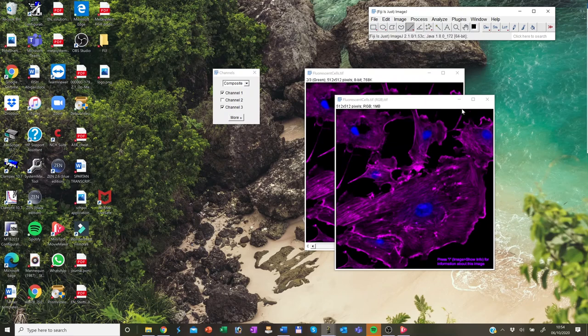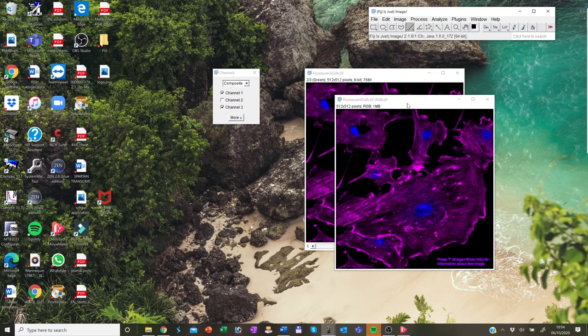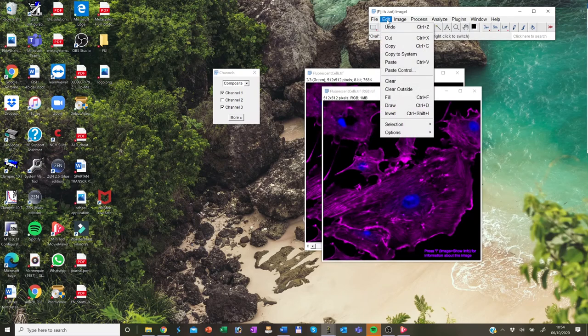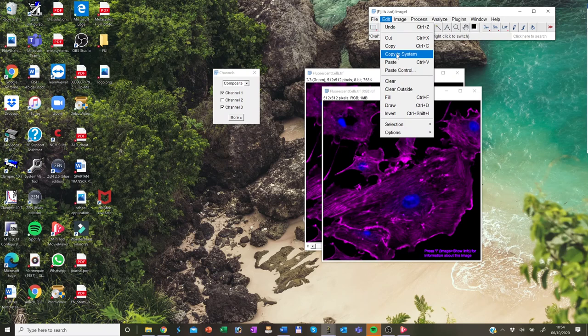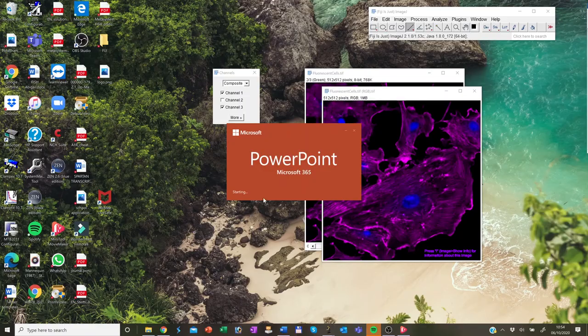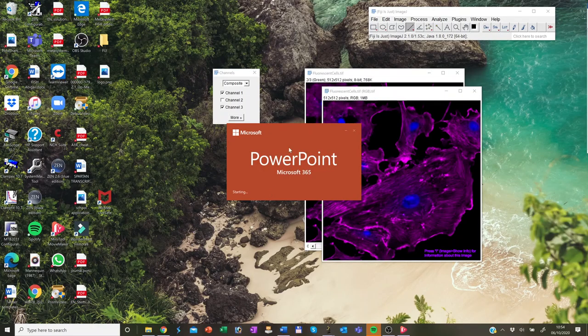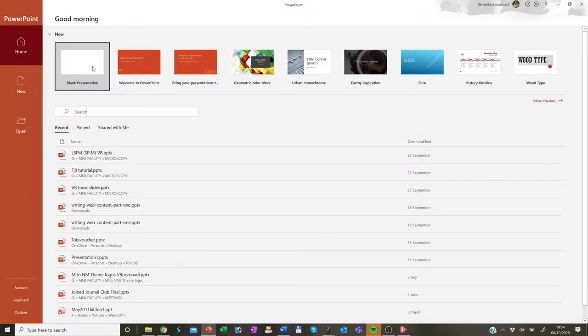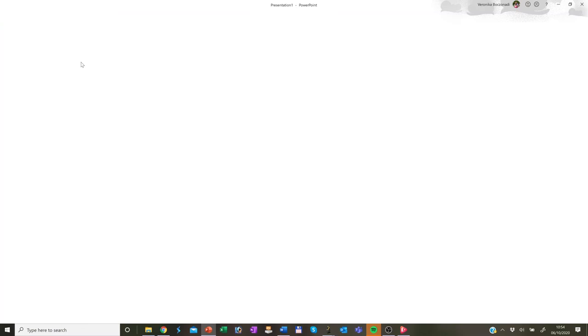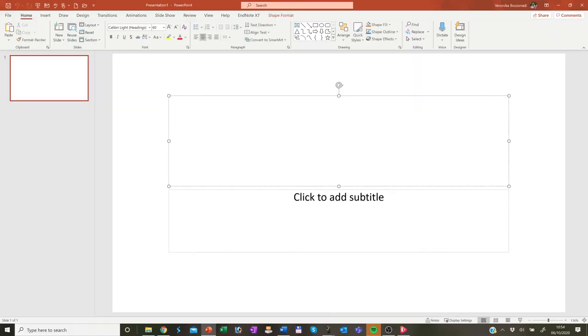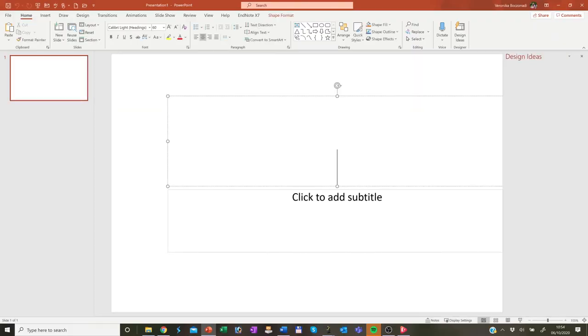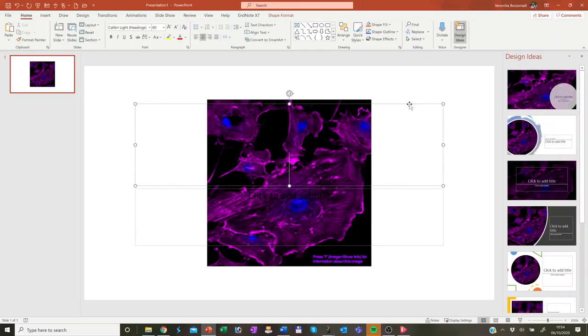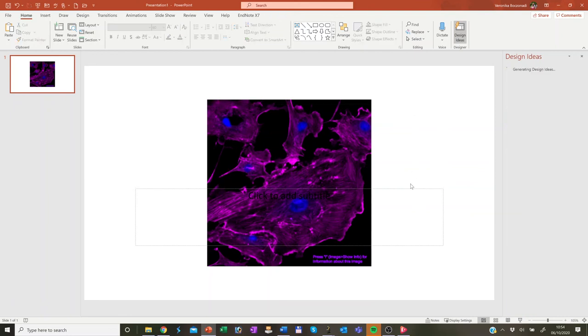To copy and paste, you can click on edit, copy to system, and straight away, you can place that image into PowerPoint, or any other presentations. So for example, here, and I paste it into the PowerPoint presentation.